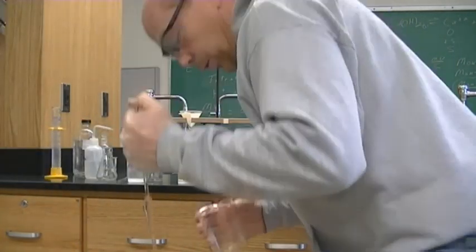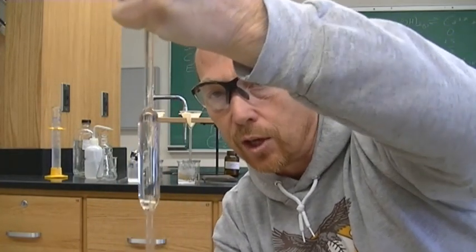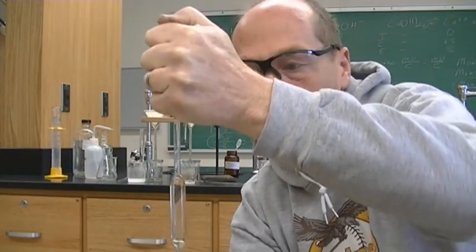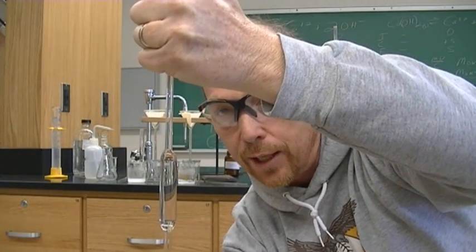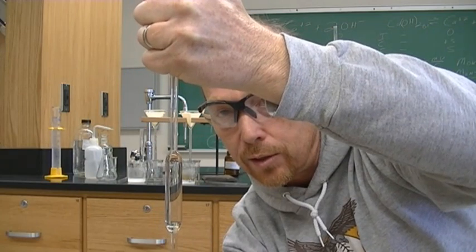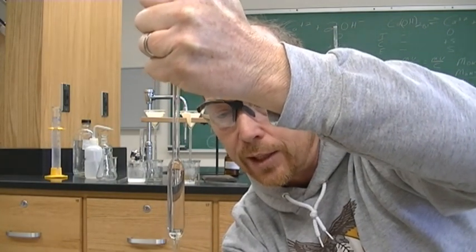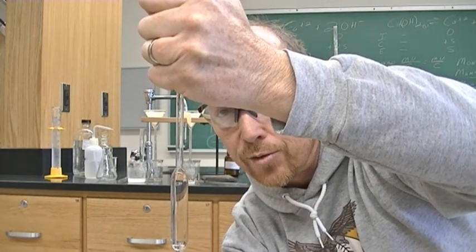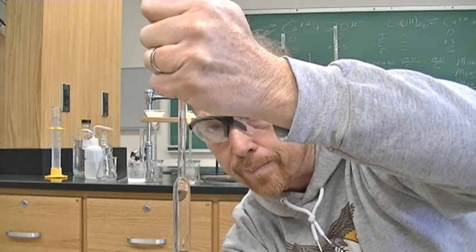All right, so this is where it is difficult. I sucked up way past the line. You probably can't see, but I'm way past the line. So I have a beaker here that I'm going to collect any remaining. And I have to let go. This is like a straw with your finger over it. It's not letting the liquid out. When I release the pressure of my thumb on the top, it is going to release some of the liquid.